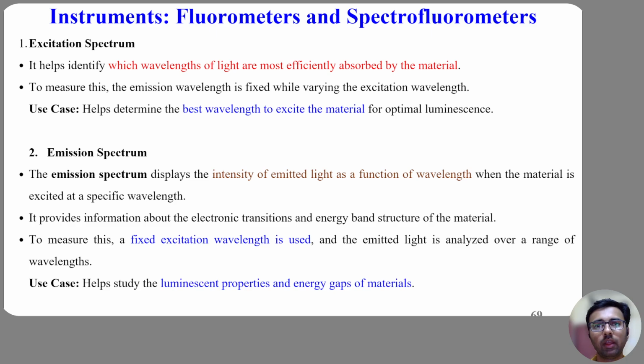Welcome back everyone in the lecture 17. We now explore the spectral information obtained using advanced spectrofluorometers. We will also begin examining the specialized hardware requirement to measure extremely faint luminescent signals.